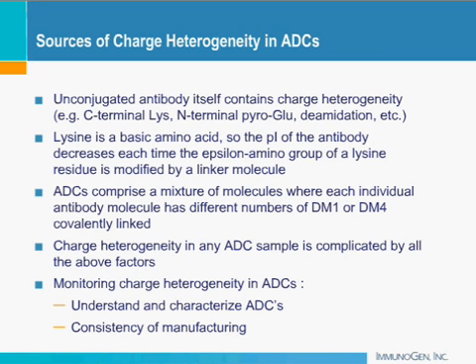And then I will talk about some method development of ICIEF for ADCs. Some examples of the parameters that affect ICIEF separation are focusing time, the ampholyte composition, additives in the sample prep like urea, and sometimes even interferences from formulation buffer components of your analyte itself. And I will talk about some of these examples in detail.